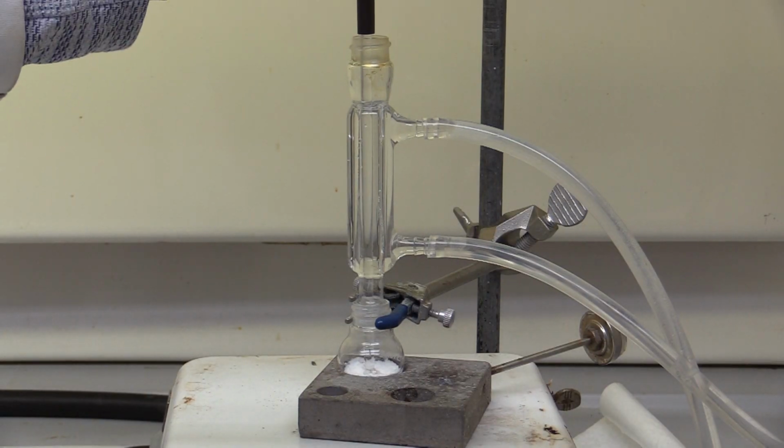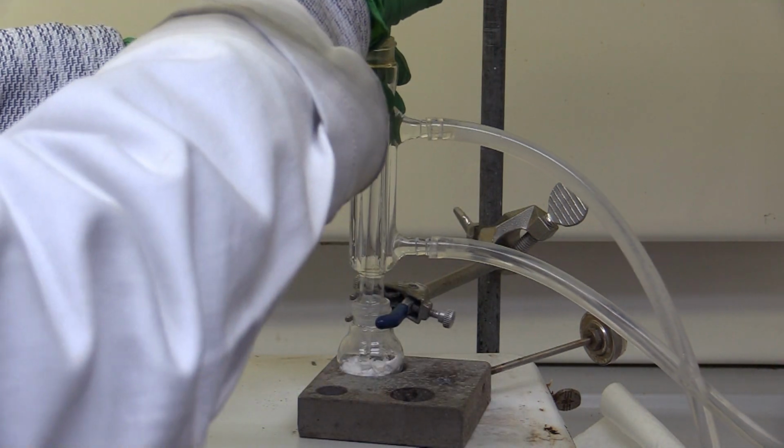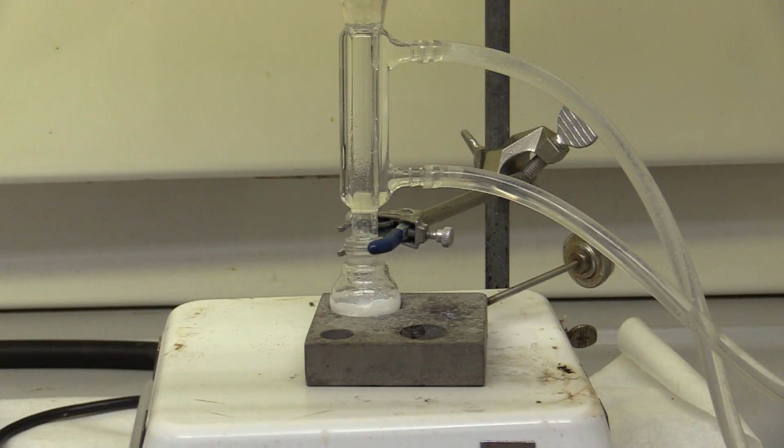If the reaction mixture is clumpy and does not appear to stir, use a glass stir rod to disrupt the precipitate that formed. Also make sure the flask is clamped as close to the middle of the stir plate as possible. This will help with the stirring. If after breaking up the chunks and repositioning the flask, the mixture still isn't stirring, add a few drops of sodium hydroxide to the top of the condenser and it will run down the sides into the flask.